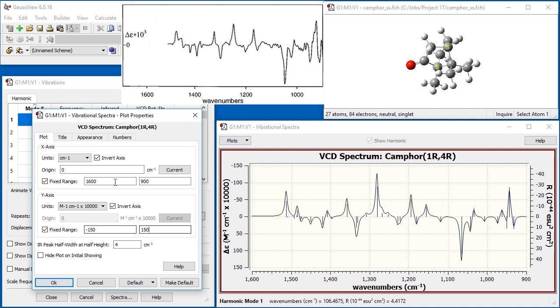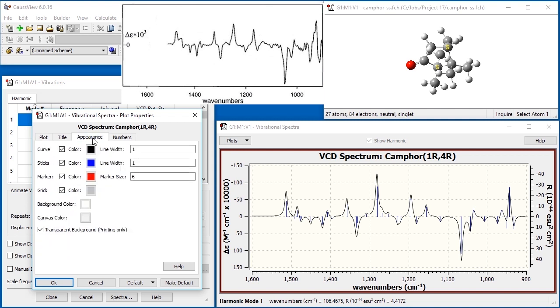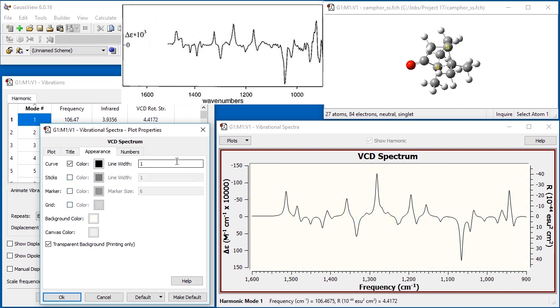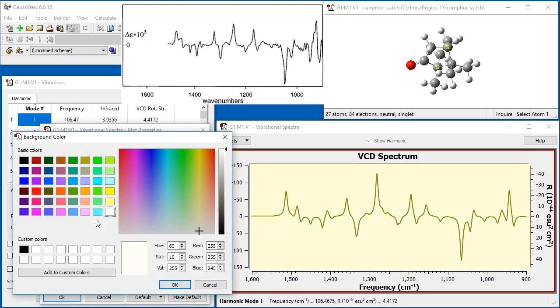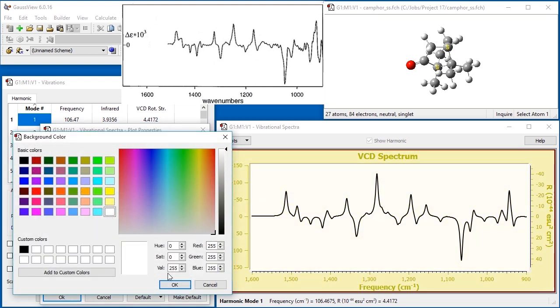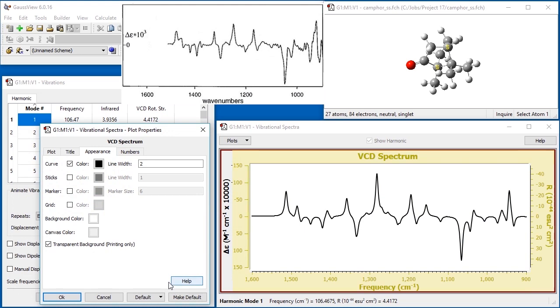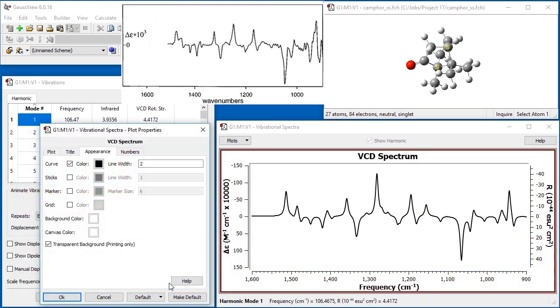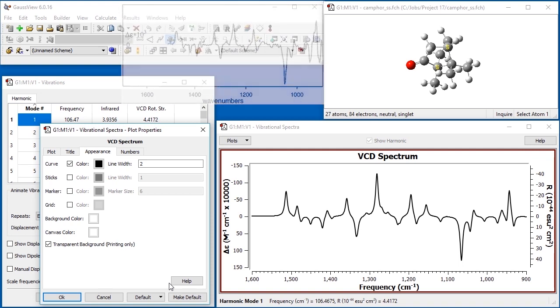we use controls on the appearance tab to fine-tune the plot. We turn off the current peak marker, the sticks within the spectrum, and the background grid. We make the plotted line thicker, and we change the color of the background and the canvas from GaussView's usual light gray colors to white, which works better in print. We can then save the customized spectrum to an image file in the usual way.